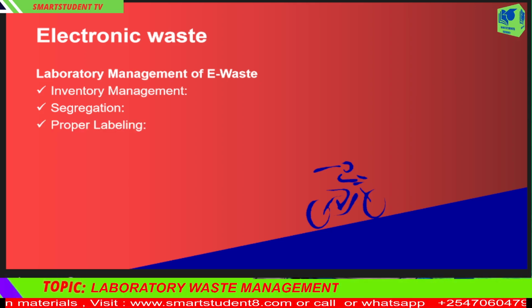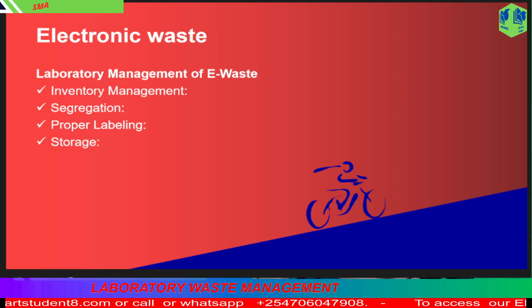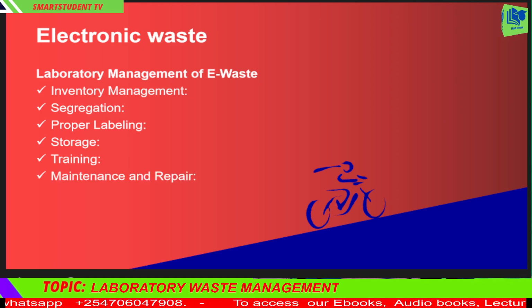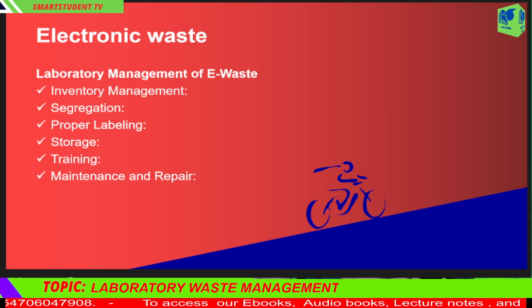3. Proper labeling. Clearly label waste bins for electronic waste. 4. Storage. Store e-waste in designated areas to prevent contamination. 5. Training. Train laboratory personnel on safe handling and disposal practices. 6. Maintenance and repair. Regularly maintain equipment to extend its lifespan.